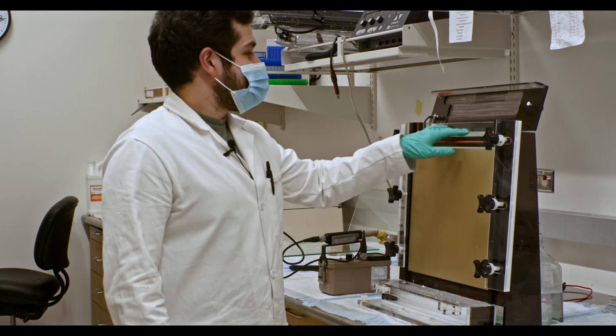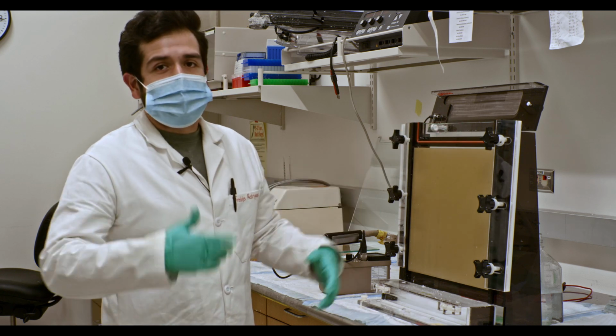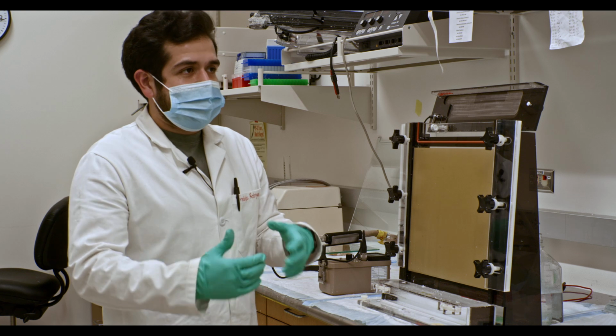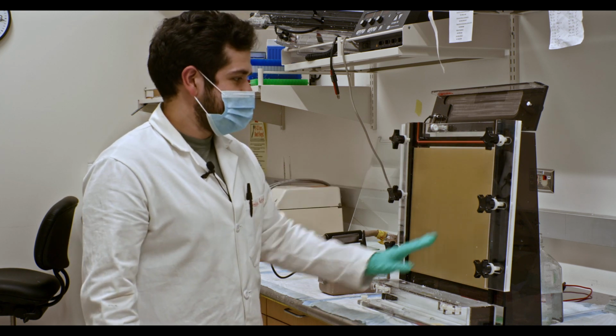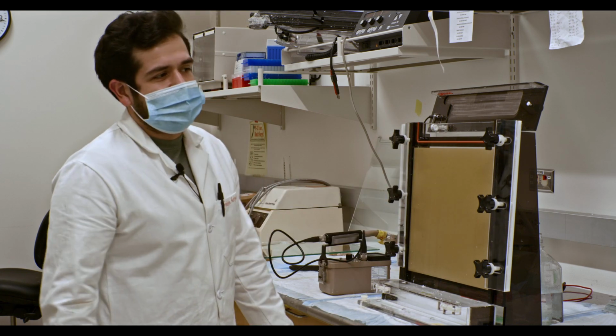You should also clean the top compartment of this gel box. As you saw, there were some gel pieces floating around, so when I was trying to drain it, it did clog it up. So to prevent that in the future, clean up the top portion too. If there's any sort of salts here on the aluminum backing, just make sure that you clean it up too.